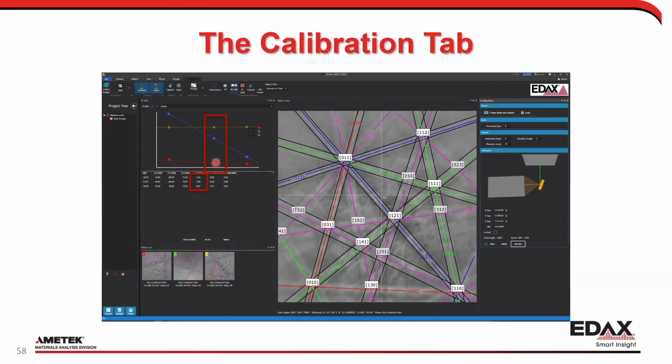Here you can see this one's a little bit off trend. The error is a little bit high. I can either redo this one and say, hey, this should be better, or I can retune it and say maybe I didn't tune it well enough. But again, if these errors are higher than 2%, I'd usually kick it out. So 2% is the value I use to say, hey, I don't like it.